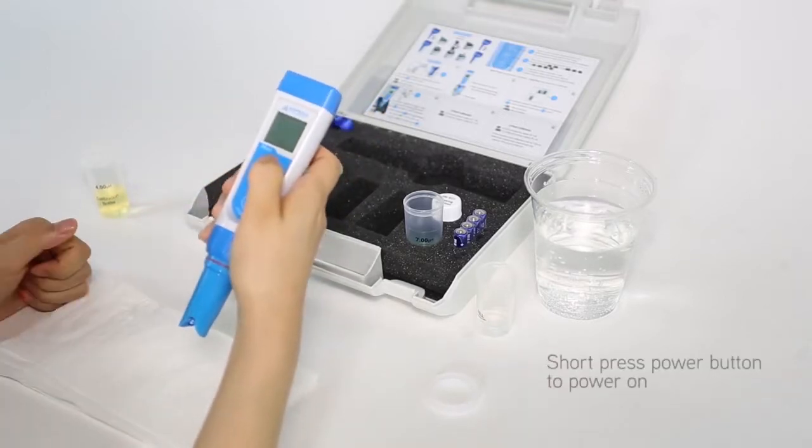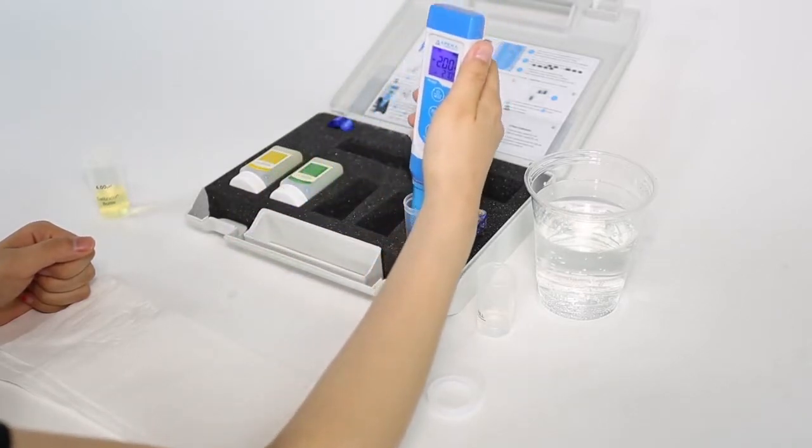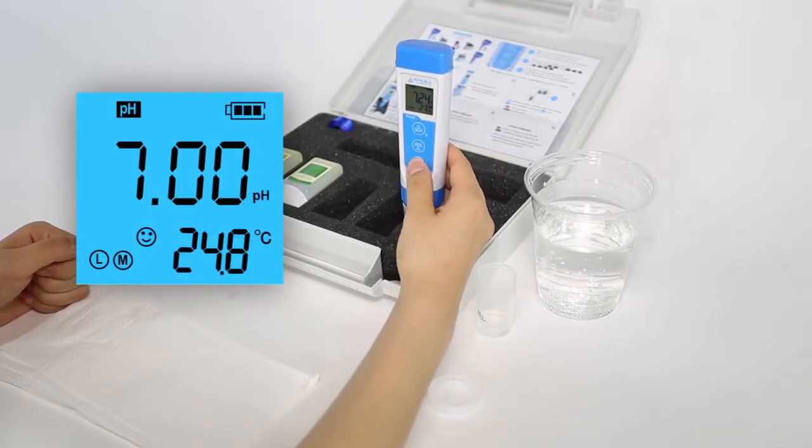Short press the power button to turn on the tester. Dip the probe in 7.00 calibration solution. If the reading is very close to 7.00, that means the probe is very accurate and calibration is not necessary.